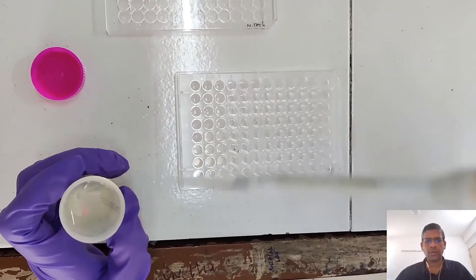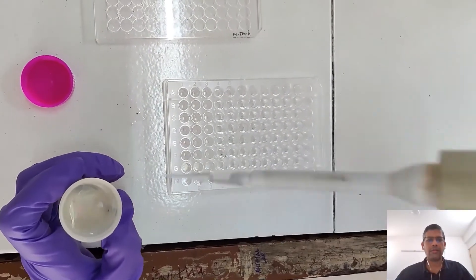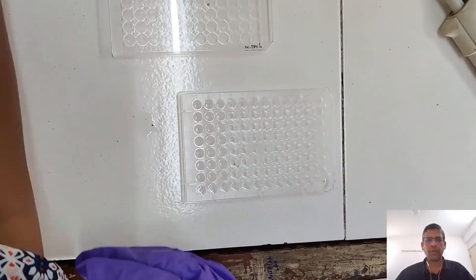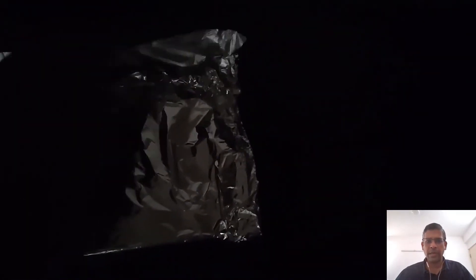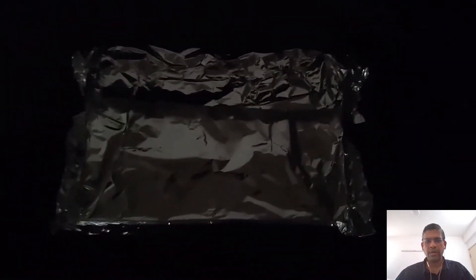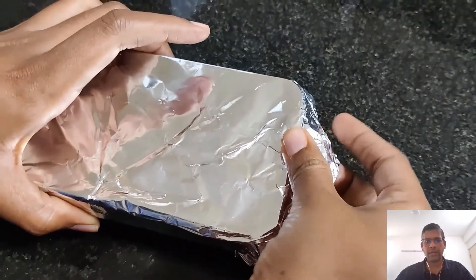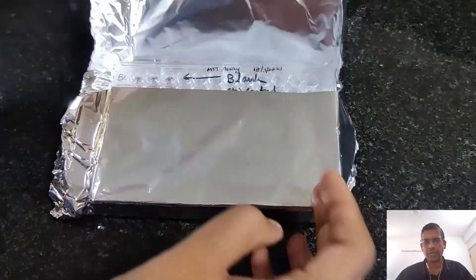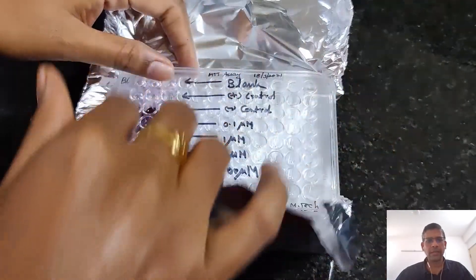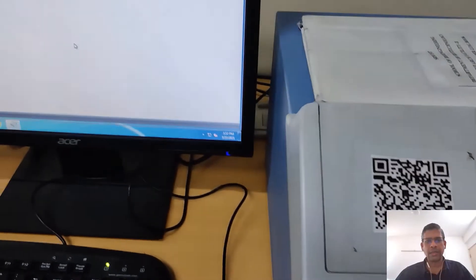Next, we add the MTT reagent. This must be done in the dark because MTT is light-sensitive. After adding the MTT reagent, the plate is incubated for 3 hours at 37 degrees, then the formazone crystals are solubilized with DMSO. The plate has been wrapped in aluminum foil to prevent any light exposure. After incubation and solubilization, you can see the nice formazone crystals have been solubilized.